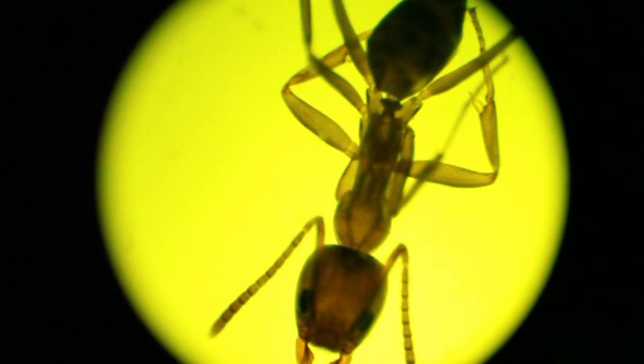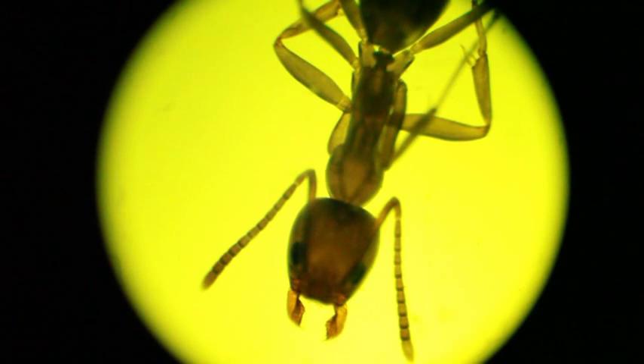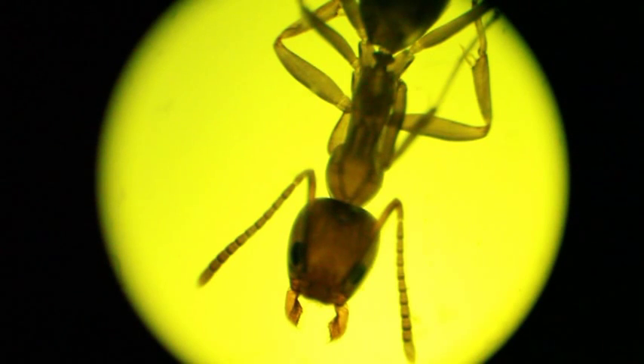Alright, well that looks a little bit maybe too yellowish, but I do have the yellow filter on it. I think that's the reason why. If I know my colors correctly, I'll just put a filter — should make the view a little better. Oh, you can totally see the ant moving, that's exciting. Alright, let me get the blue filter on.